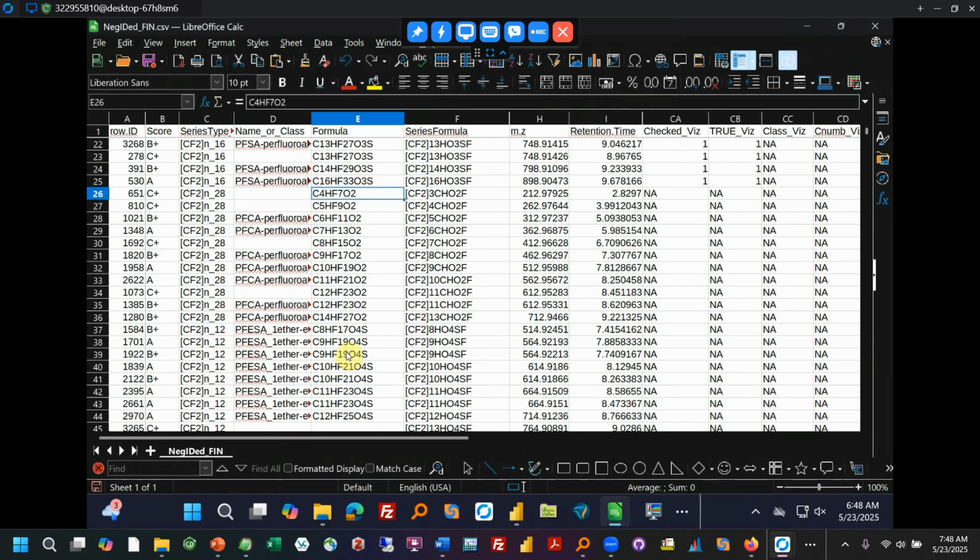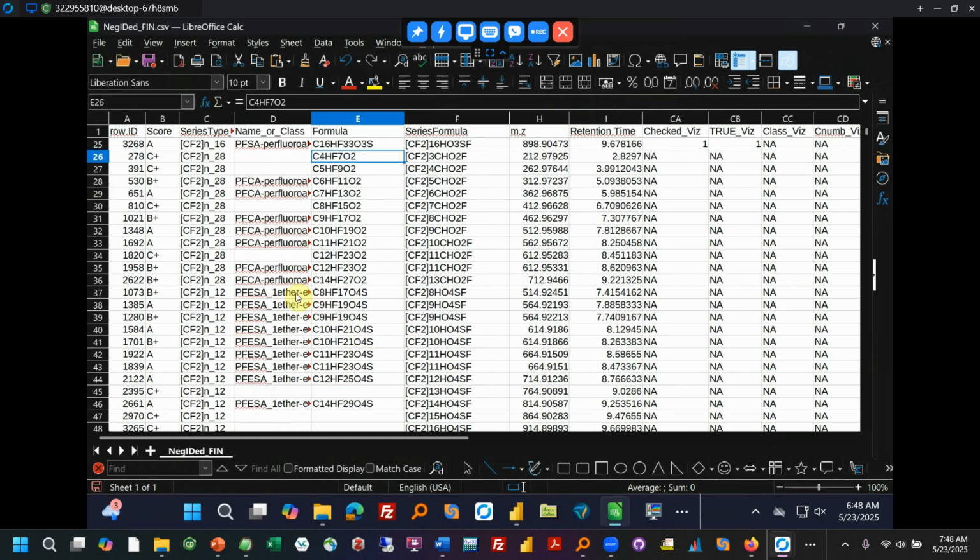So I'm going to skip the carboxylic acids because we won't annotate an entire database today. That would be a long video to watch. And I think these ethers might be a little more interesting. So let's look at them.